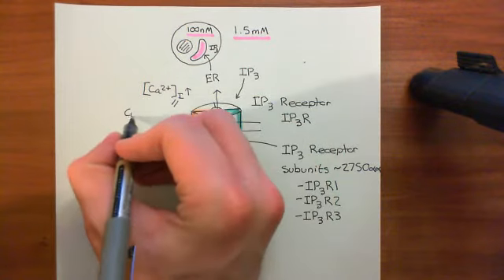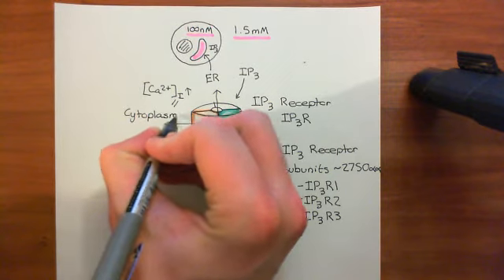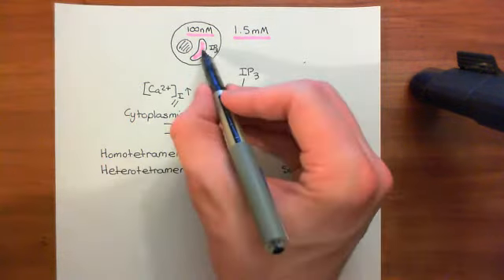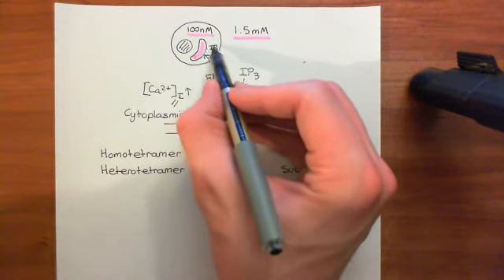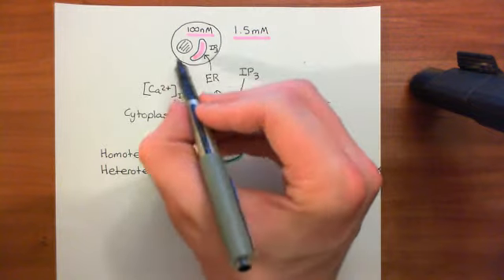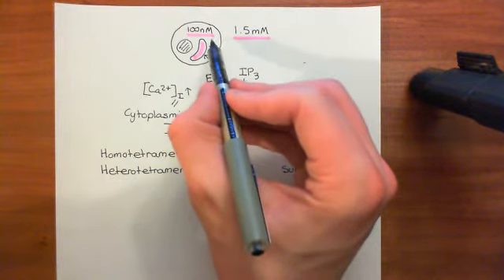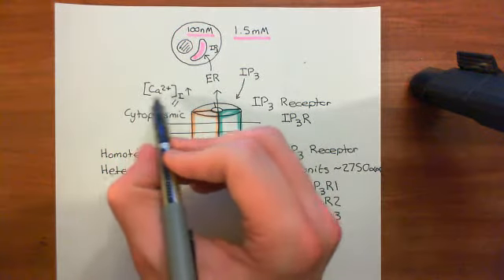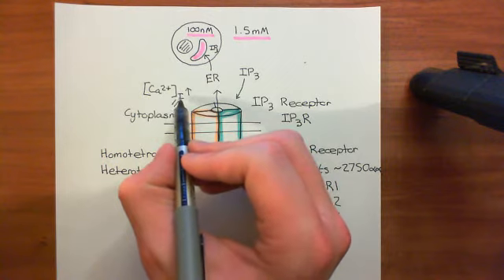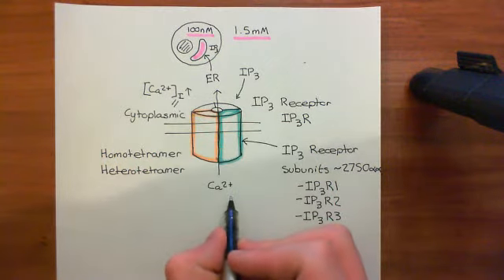Intracellular in this context really means cytoplasmic. Because you might say, but hang on, you've just released the calcium from the ER into the cytoplasm. You haven't actually increased the number of calcium ions inside the cell. You've just moved them from the ER into the cytoplasm. So surely intracellular calcium concentration hasn't gone up. But then you have to remember that intracellular really means cytoplasmic, not endoplasmic reticulum.